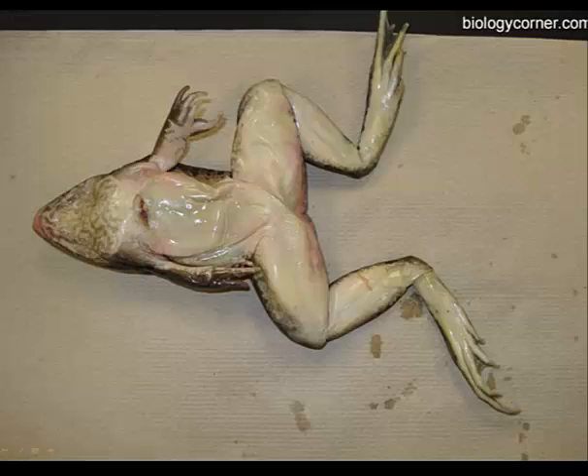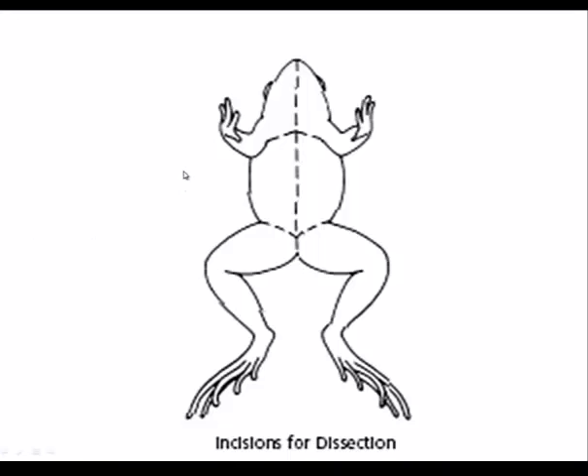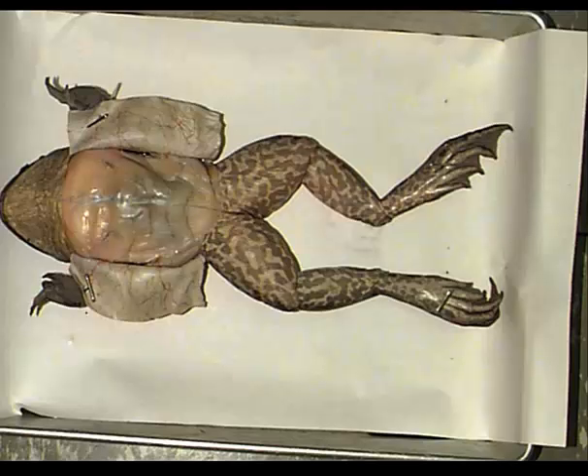To open up the body cavity of the frog, turn it so the ventral side is up. Make a cut from the cloaca all the way up midline to the base of the jaw. Then cut from the lower portion of the forelimb across, and from the top portion of the hindlimb to the midline and across. This will allow you to peel back the skin layer.